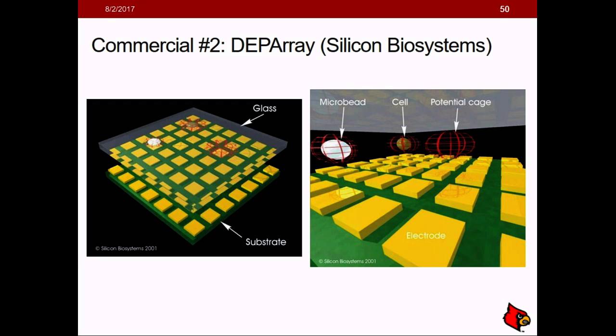They're trapping them with negative dielectrophoresis within a potential cage, and then a confocal camera will come through and scan every single particle within the system and provide the user with a library of optical responses for everything that is trapped. And then the user decides whether to keep some particles or to remove other particles.